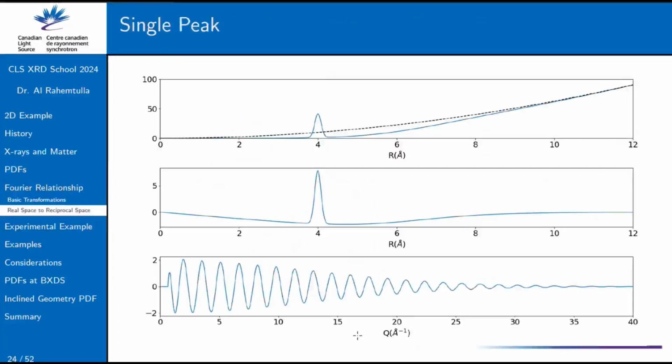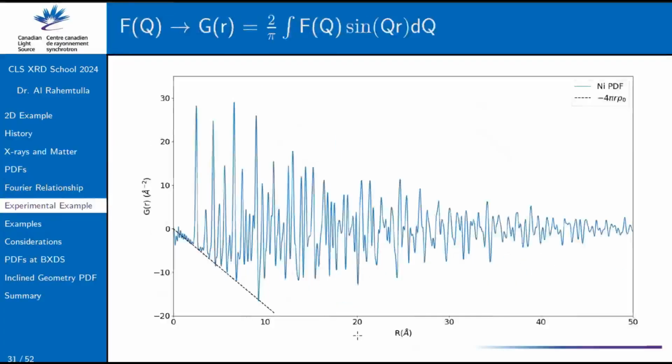The other area where there could be noise, we go to, is usually way out in very low R, which is usually where a lot of residual noise that didn't get removed from your background ends up living when you do your transform. There's a lot of random noise and oscillations that can happen here. The cleaner this is, usually the better a job you did prepping your data, but this will rarely ever be perfect. Even here, it's not absolutely perfect. There's a weird little dip here.